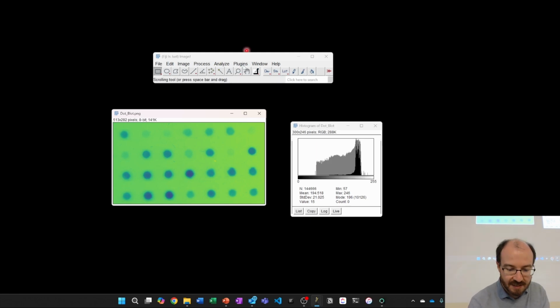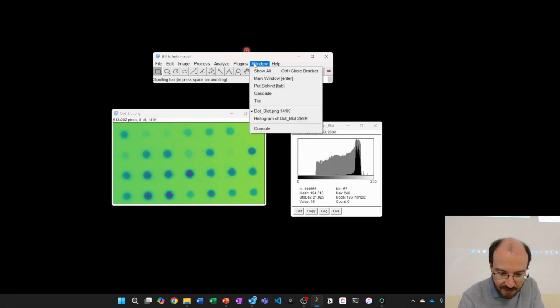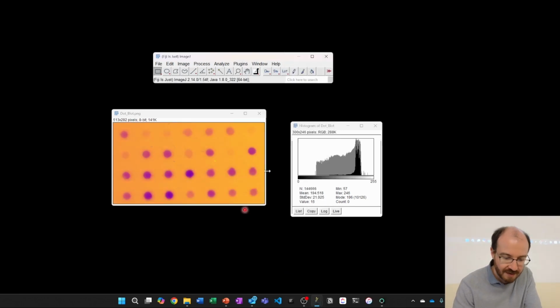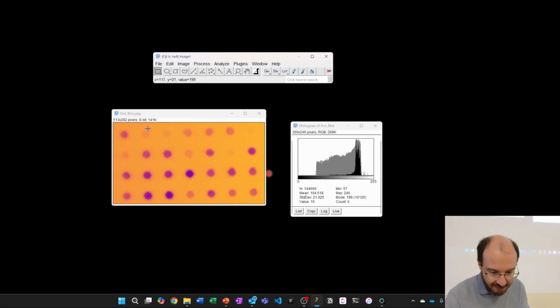There were a couple of these perceptually uniform color maps. For example, if you go to almost any of these, I think plasma or magma, all of these are an attempt to be perceptually uniform, so that you can very clearly see, oh okay, there are some dim spots there, and with my eye I can kind of quantify the intensity of this.